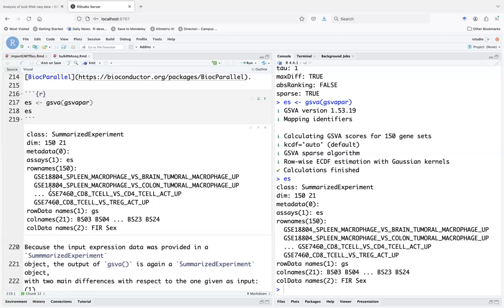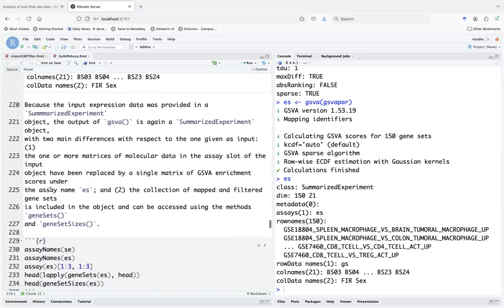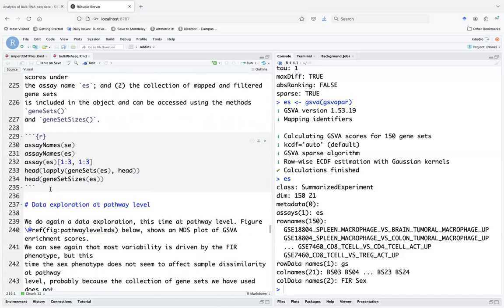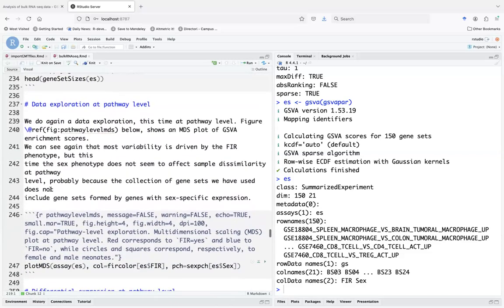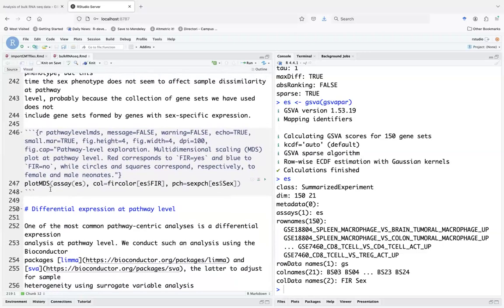No, but this log CPM data is using the limma pipeline, so it's using TMM normalization, so they are adjusted for library size, let's say. Which is one of the major factors that influence differences, the variable sequencing depth across libraries. And you want to have at least that kind of thing, the RNA composition.